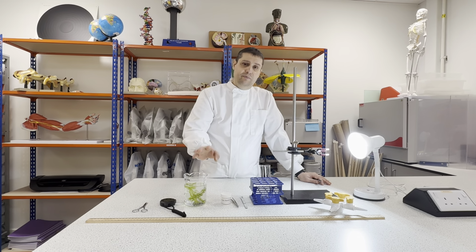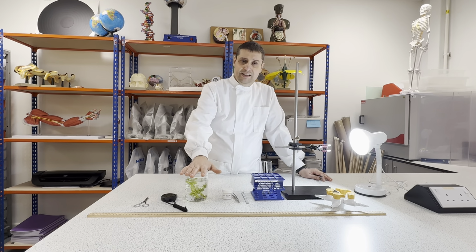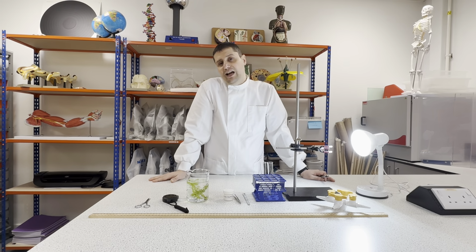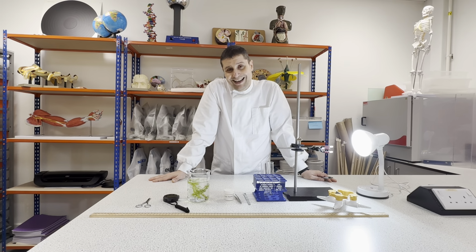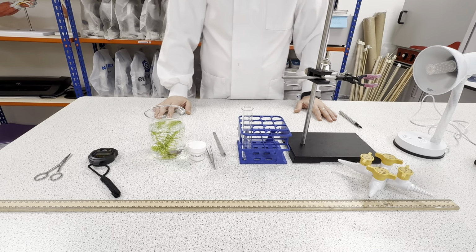So the main aim of this practical is to change the distance between the plant and the light source and see what happens with the rate of photosynthesis, counting the number of bubbles. Now let's start with the procedures.